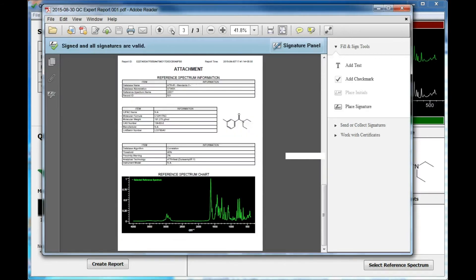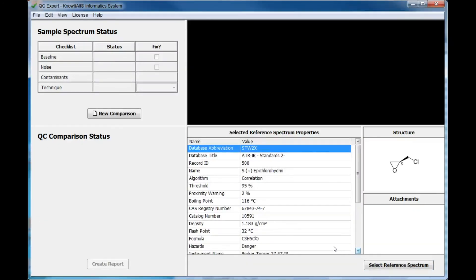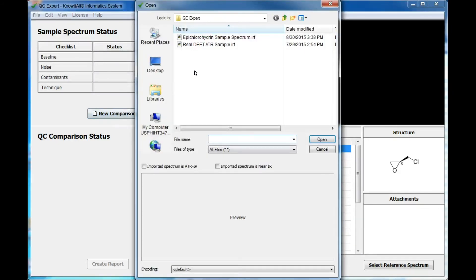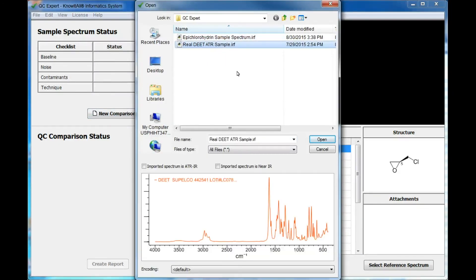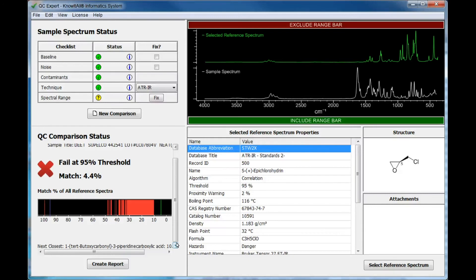Now, let's see what QC Expert does when there is not a good match. We'll compare the same sample spectrum to a completely different reference spectrum. As you can see, the sample fails as it is obviously not a match to the reference spectrum.